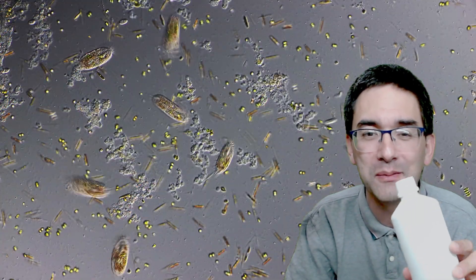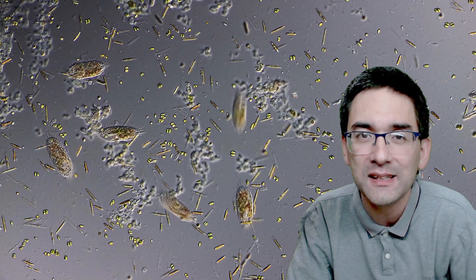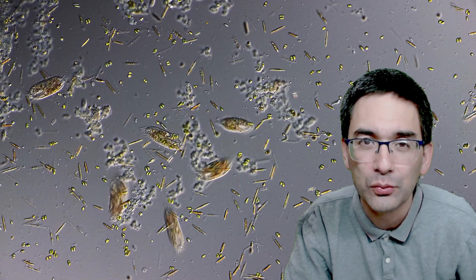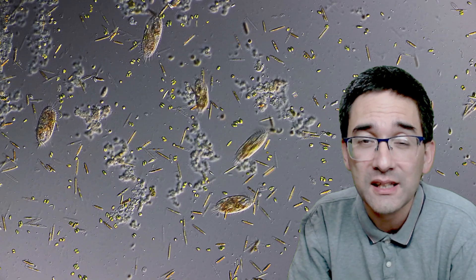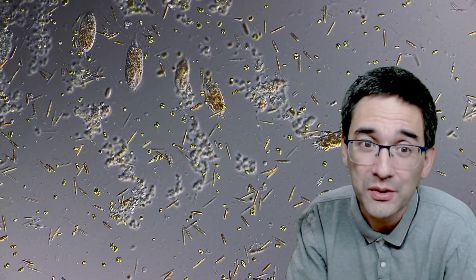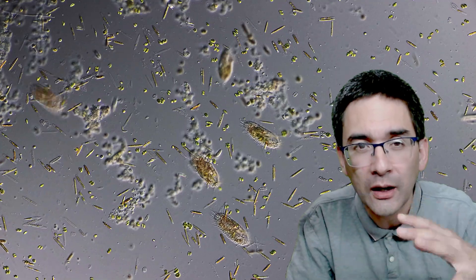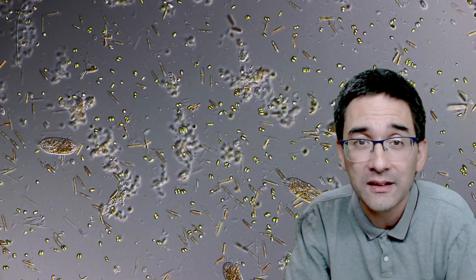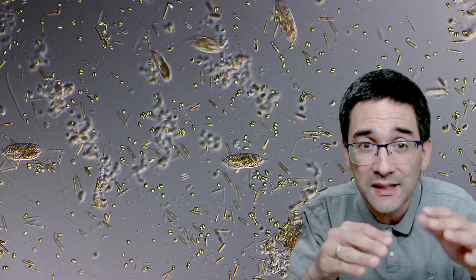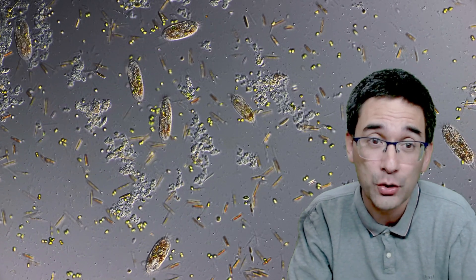Today I wanted to show you what happens when you add some hydrogen peroxide. One of my viewers requested that I try out different types of disinfectants and see their effect on water microorganisms. Here's one of those water samples. The ciliates are still swimming around pretty normally, but look at how all the algae—these little green dots—start moving downwards. This is because I added a small drop of hydrogen peroxide to the microscope slide. The liquid is now being sucked in beneath the cover glass, causing this streaming motion of the fluid.